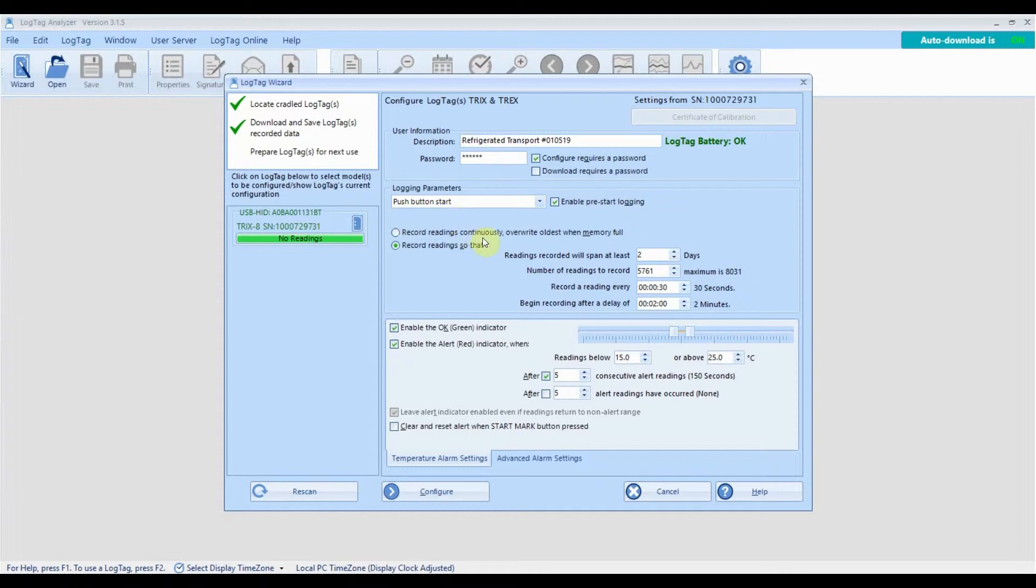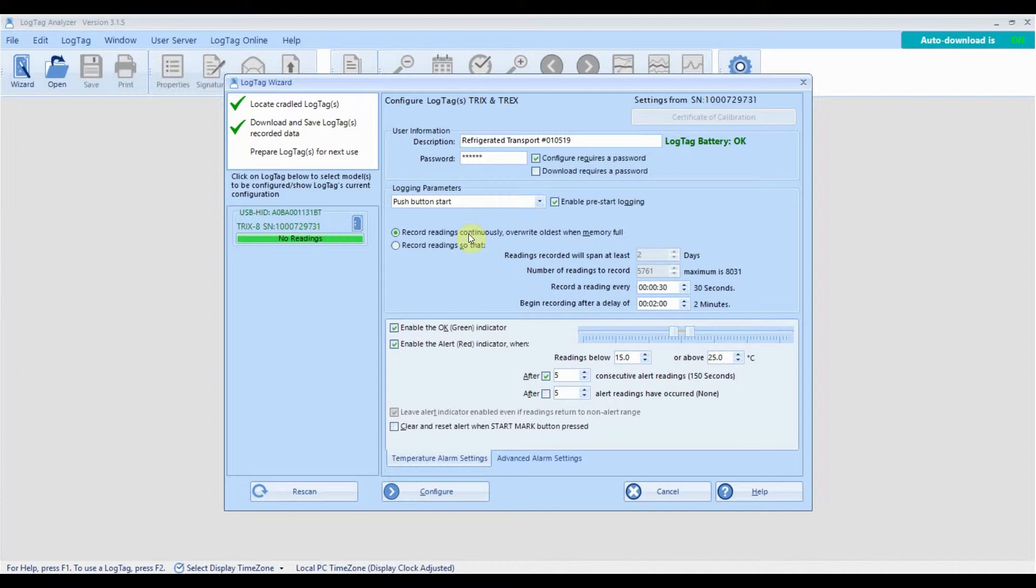Next, select whether you want the log to stop recording once the memory is full or to overwrite the oldest readings so logging never stops until it's reconfigured or the battery runs low. This is called continuous recording. If you don't want to record readings continuously, enter the number of days your logger will record for before stopping.